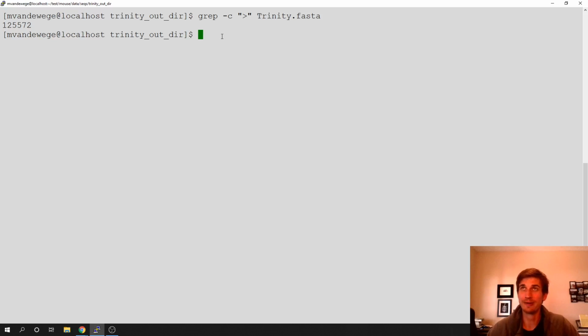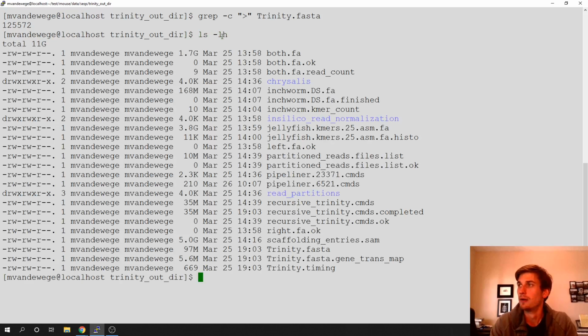But you could predict that within the liver tissue, there's probably only 10,000 genes expressed and maybe 5 or so unique transcripts per gene. And so these transcriptome assemblies tend to have some artifacts, and we usually only want to filter for things that we can recognize, particularly like CDS sequences and things like that. But I think I'm going to call it there for now. This is just performing the transcriptome assembly.